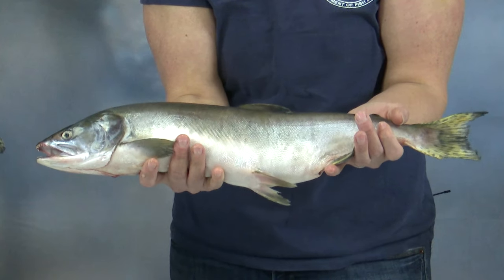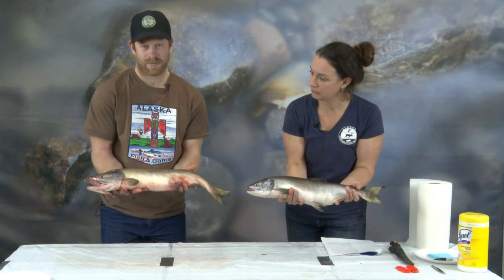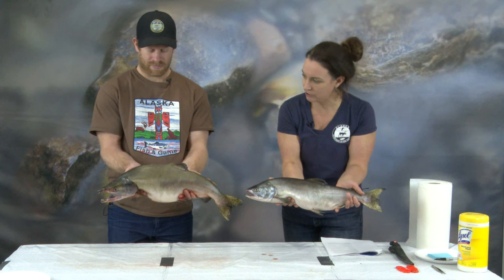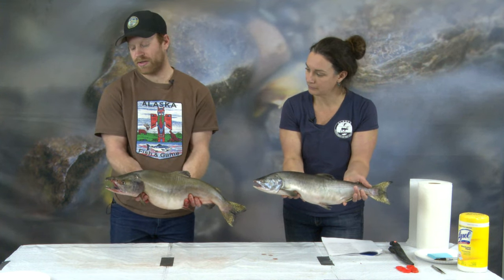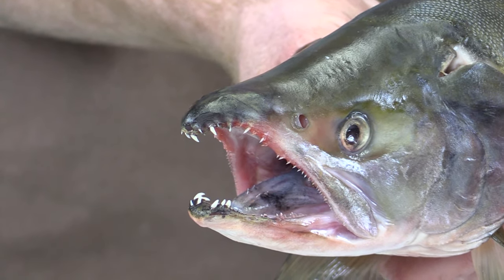Now we want to show you the difference between a male and a female pink salmon. The female has a more round, soft belly because she has eggs. The male has a more muscular belly because they have milt. The female has a smaller head and does not get a hump, whereas the male is starting to develop a hump on top — that's indicative of a male pink salmon. Another thing indicative of a male salmon is the upper jaw is hooked, which is called a kype. Males develop this much more than females.